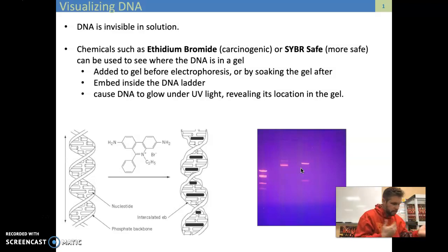By the way, I have this piece of equipment right next to me. I almost forgot to show you. We're going to use something called a transilluminator in order to see our DNA. This is going to shoot some UV light at it. This is what it looks like, right? Some powerful UV light will interact with that ethidium bromide that's intercalated within the DNA. It should glow. If we've got glowing, we know you have DNA. We can continue along downstream.